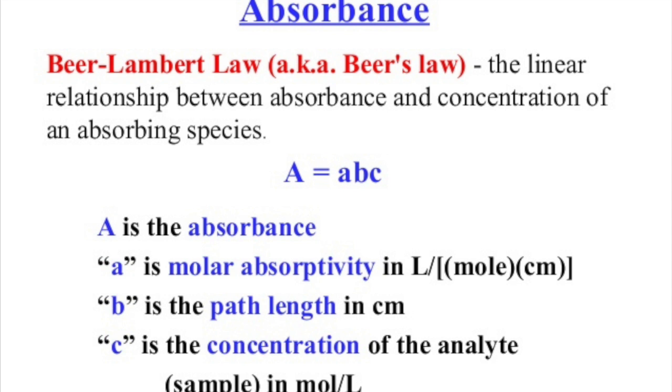Of course, there's always going to be some error in your findings because even when you zero out the machine, it doesn't get perfectly down to 0, but you would be able to adjust your graph depending on what they zeroed out the scale to be.